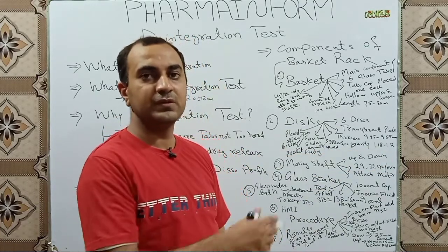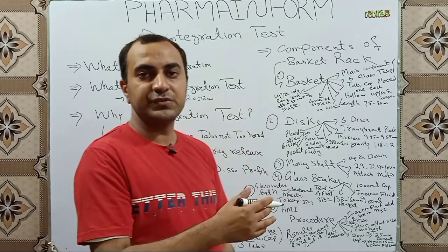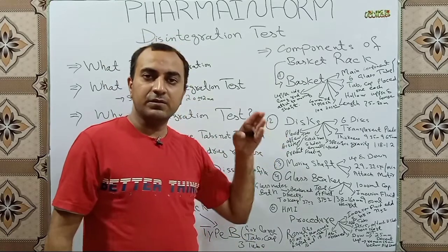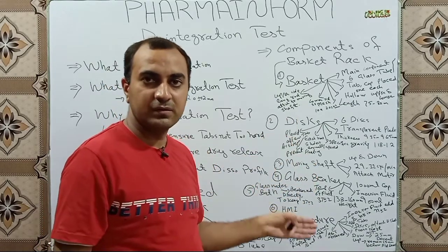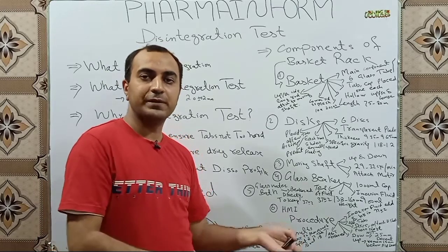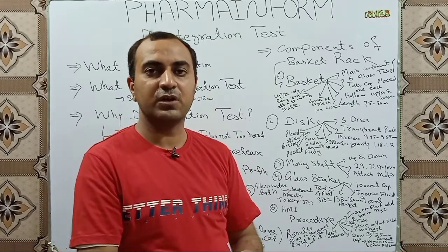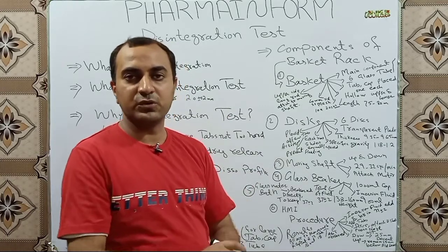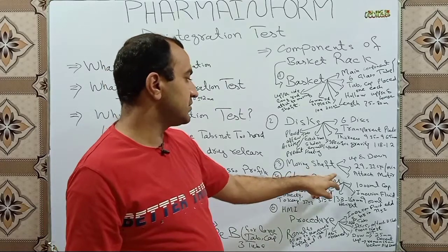Each disc has five holes, and each hole is equally spaced from the others. After placing tablets or capsules in the glass tube, the disc is placed over them to prevent the tablets or capsules from floating. One important note: the use of discs is dependent on the specifications of the monograph. If it is required by the monograph, we use these discs; if not, we do not use them.